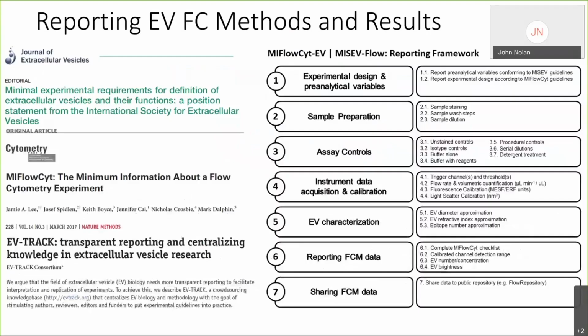And the end result is a manuscript that was just published in the past couple of months. It's intended to complement these existing guidelines documents. So there's already guidelines for how to report on vesicle experiments. That's the MISEV guidelines. There are guidelines for how to report on flow cytometry experiments. Those are the MIFlowCyt guidelines. And these guidelines are intended to sort of fill the gap between those two sets of guidelines.